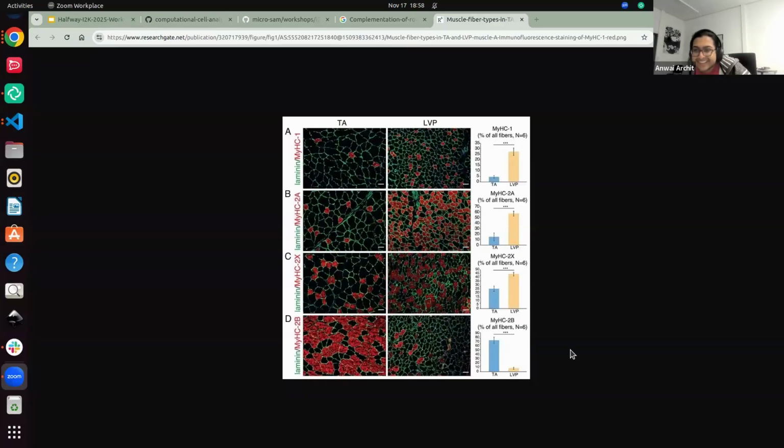Perfect. Nice. I think I am a robot. I'm not sure what's going on. But this is an image which opened. That's good. Okay. These images.